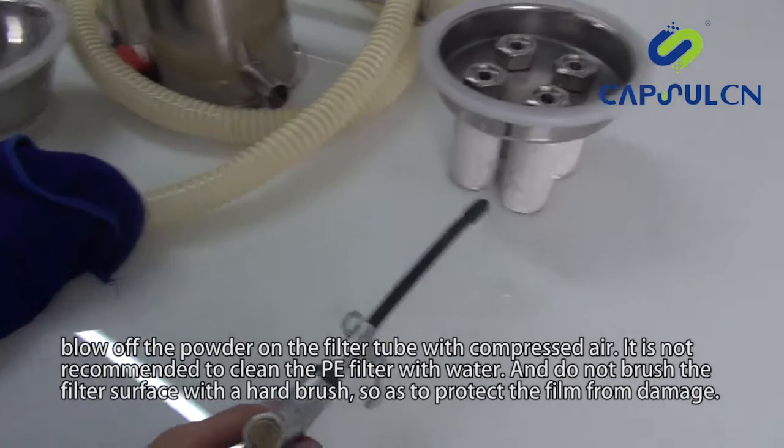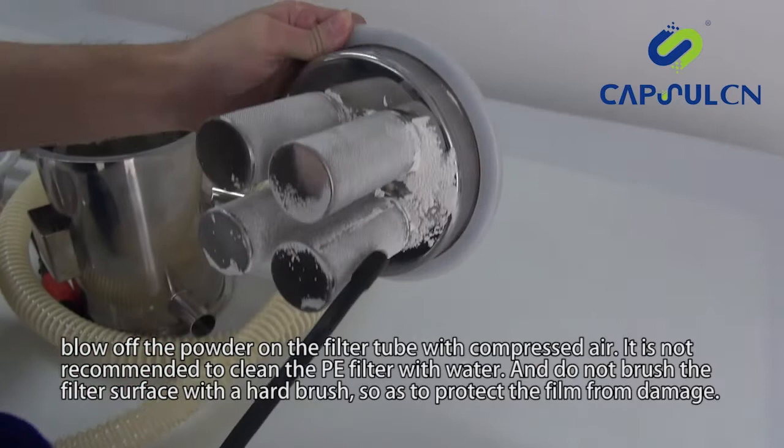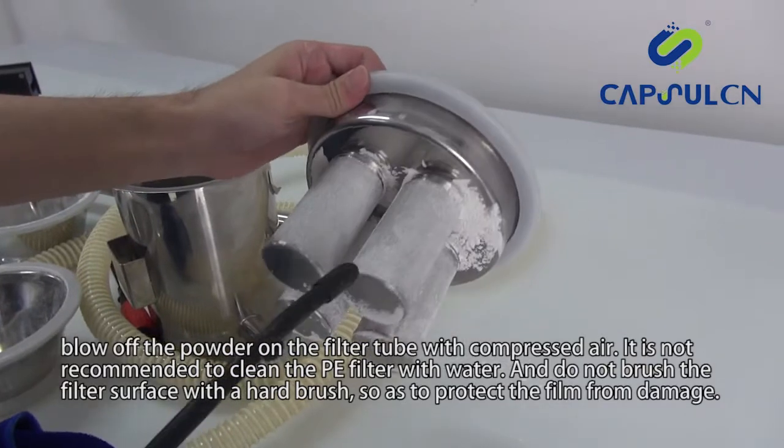Blow off the powder on the filter tube with compressed air. It is not recommended to clean the PE filter with water, and do not brush the filter surface with a hard brush, so as to protect the film from damage.